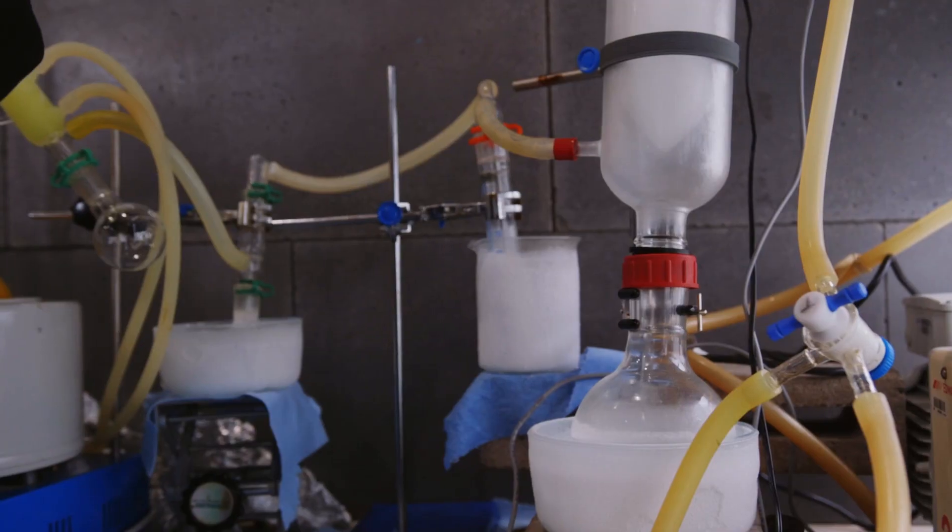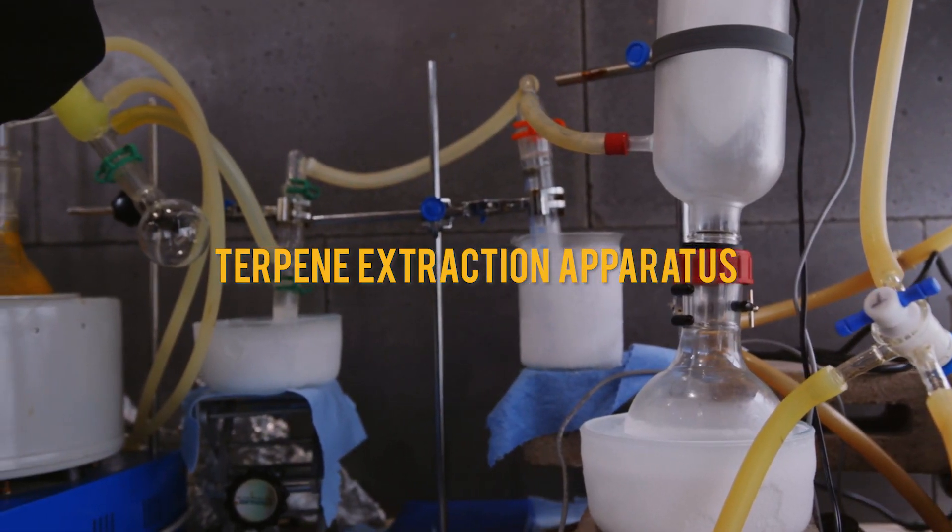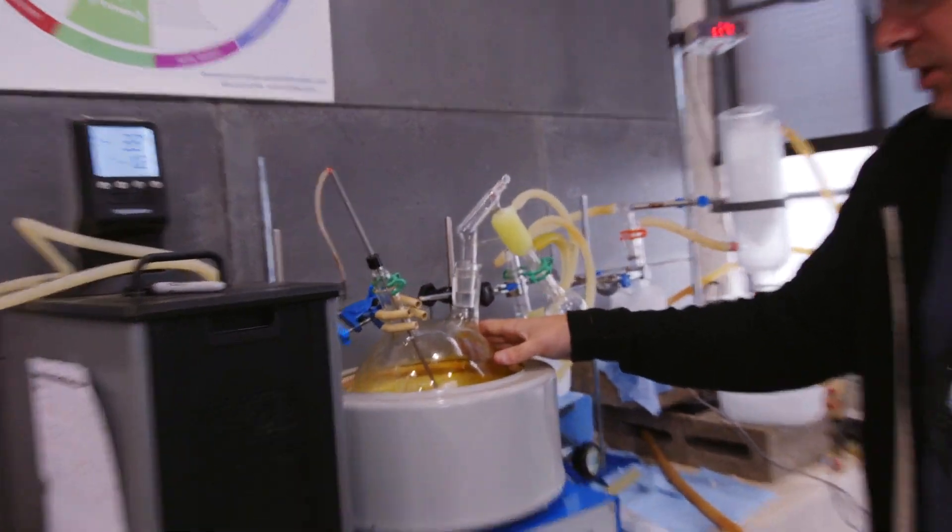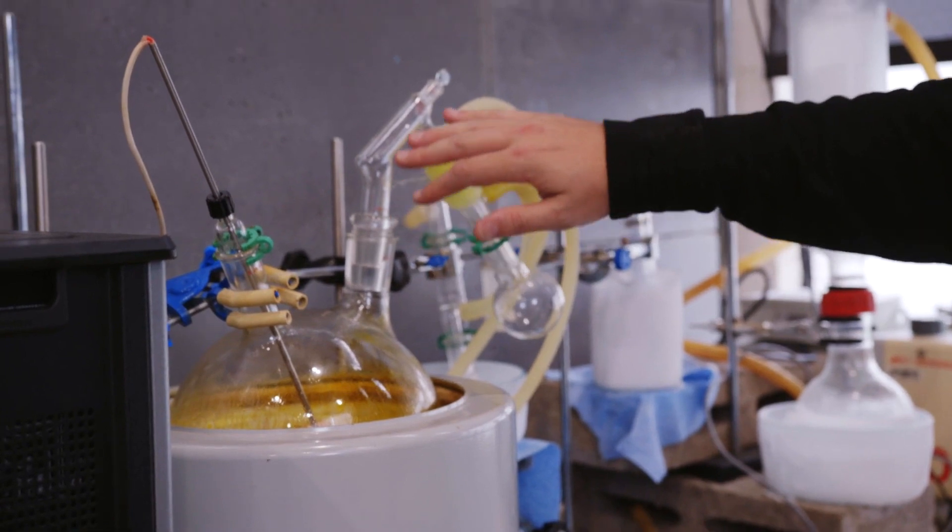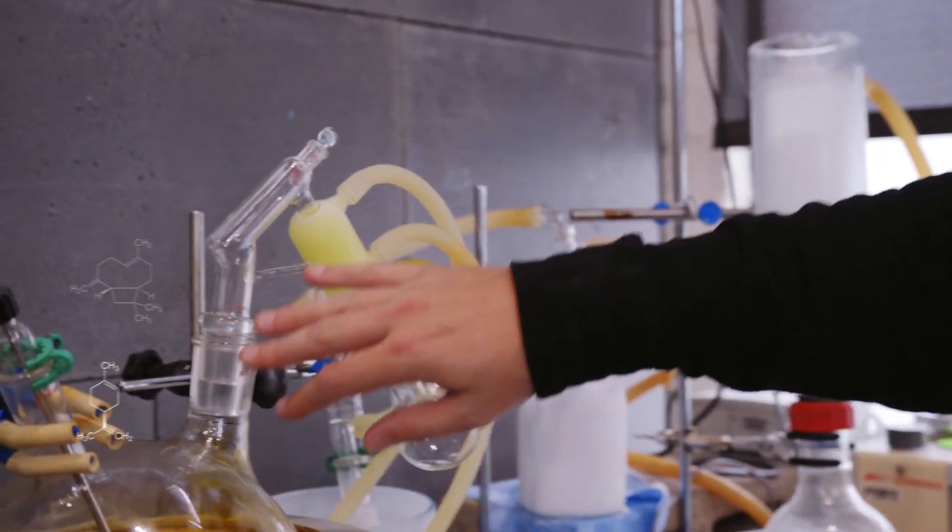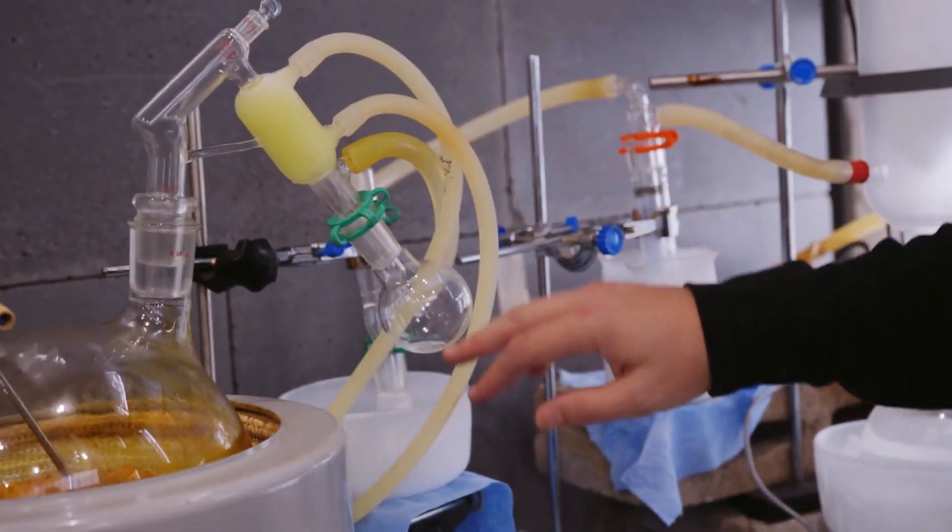So what I've got here is our terpene extraction apparatus. We've got material that we loaded from the cryo room that's being melted, and as it melts under vacuum, the vapors of the terpenes and other molecules are going to rise up here, cool down, and get trapped here.